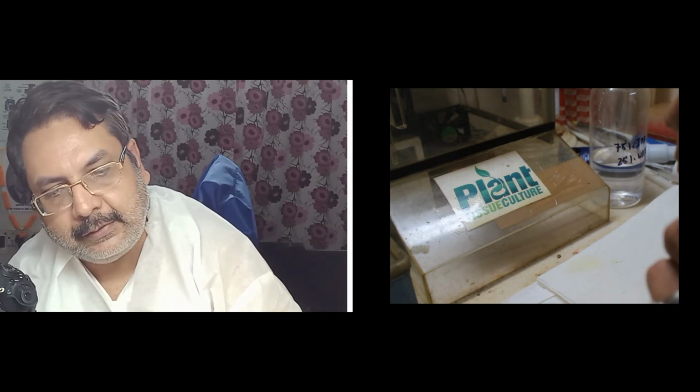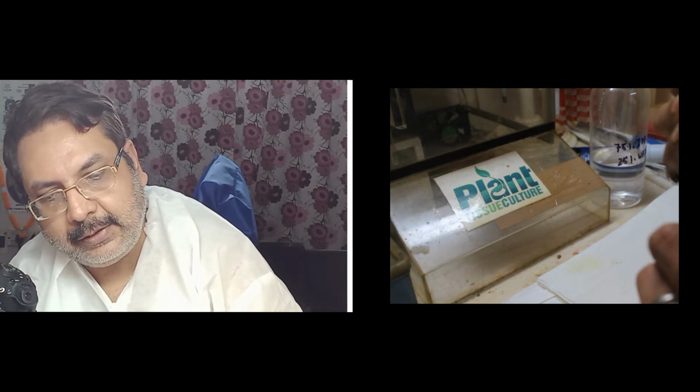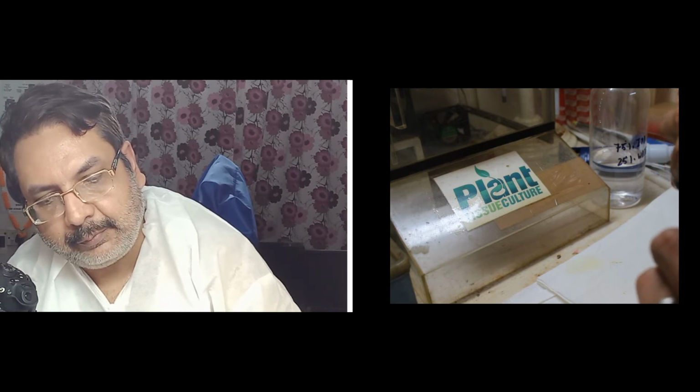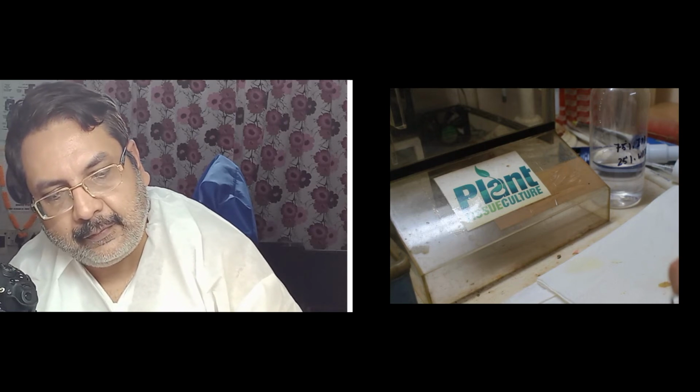and you can just remove this knob below the plunger, and you can set the micropipette as desired. So this is 120 microliter. This is moving, and this is 50 microliter, 60 microliter, 70 microliter, like that. You can just set it. So this is our auto pipette.